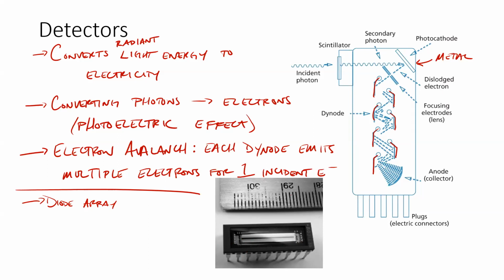And let me see. This image is from our textbook. I'm going to see real quick if it tells us how many diodes are in here. It doesn't say. Okay, so you know, this probably has on the order of, you know, 200 little diodes on this chip, right? But you can have larger or smaller ones to have more or fewer individual diodes.